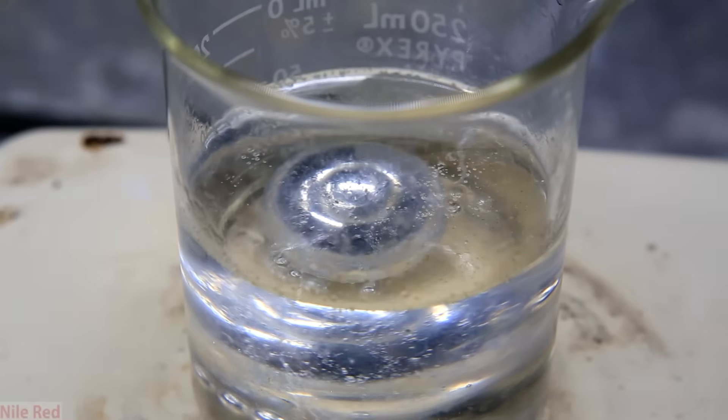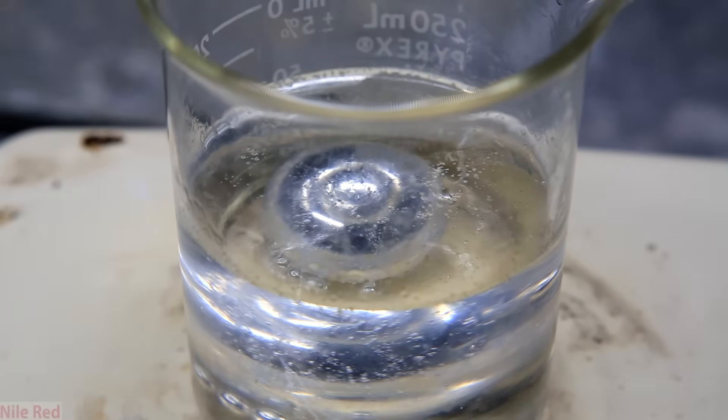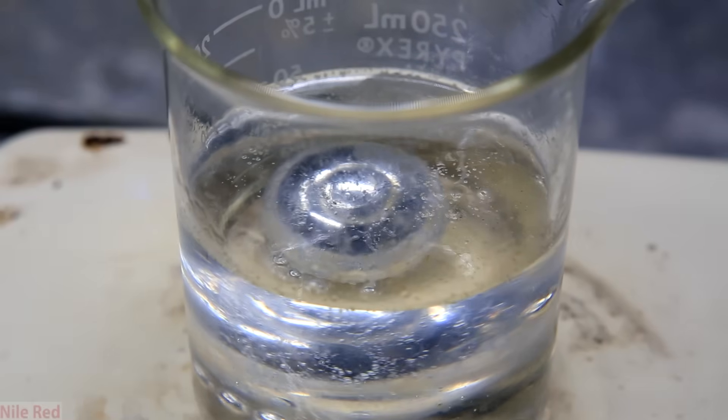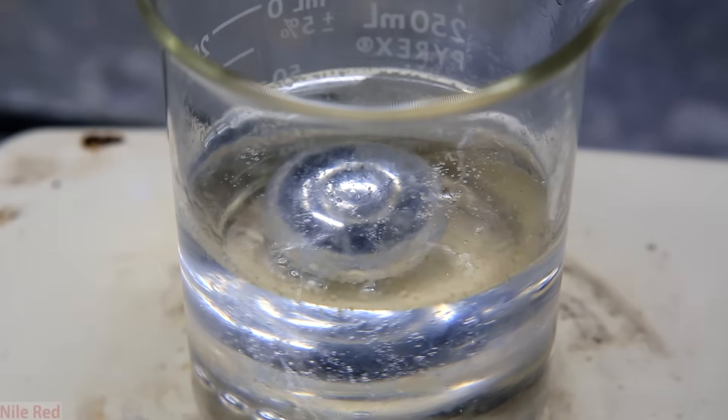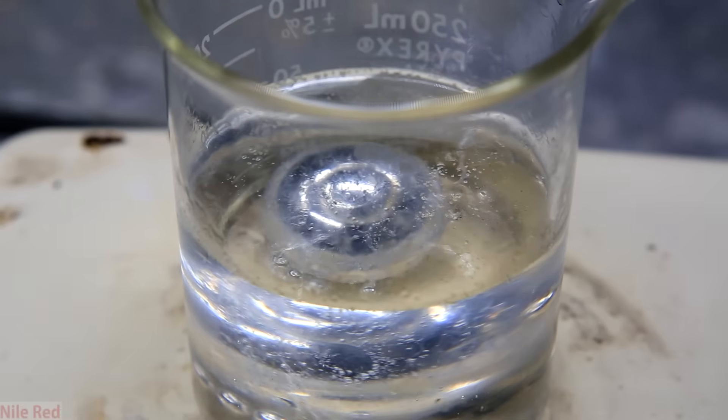One unfortunate thing when using mineral oil is that the potassium would float in it and a little bit of it is exposed to air. It's not really dangerous, but this part that's exposed might be a little discolored compared to the rest.